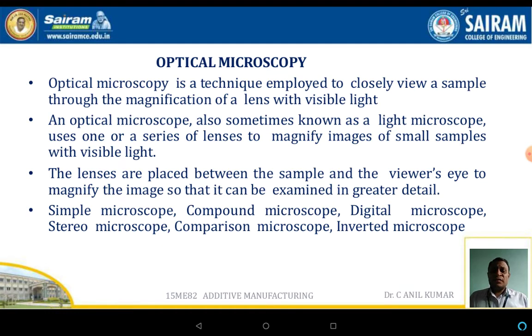Now the term characterization refers to the material such that the structure and also the properties are probed and measured. What we are measuring is either the dimension, or the shape, or the type of particle or type of element, and it is done either at the macro level, micro level, or even the nano level. For that reason, optical microscopy is most essential to ascertain the material characteristics.